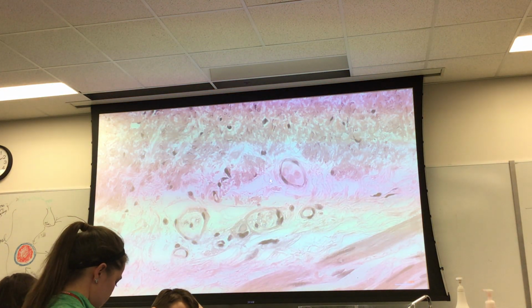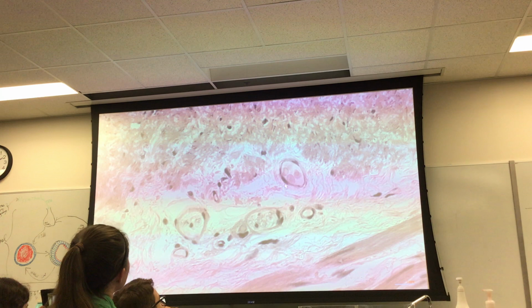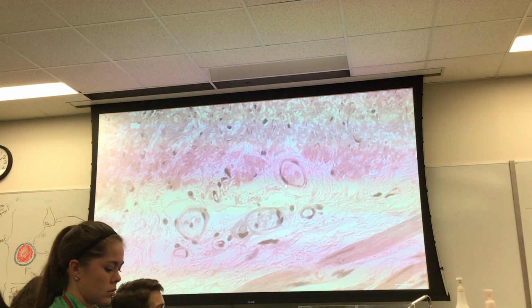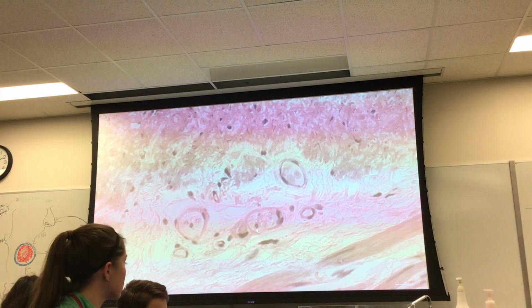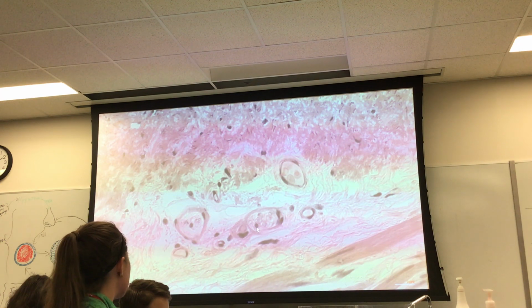So question, what is the name of this cell right here? What do you call that? Well, part of this involves, what is this? You see how those are red blood cells? So that must be an endothelial cell. Next question. What do you call that cell? That nucleus represents a cell type best described as what?